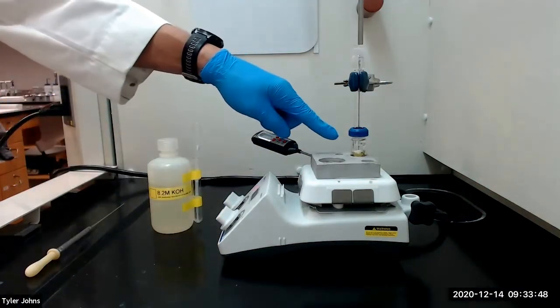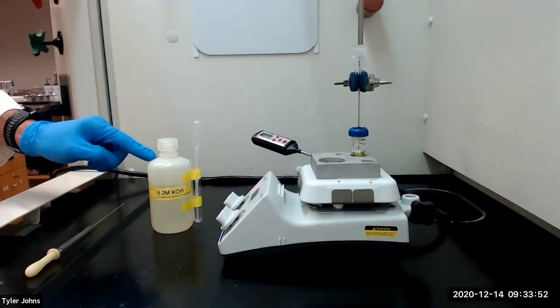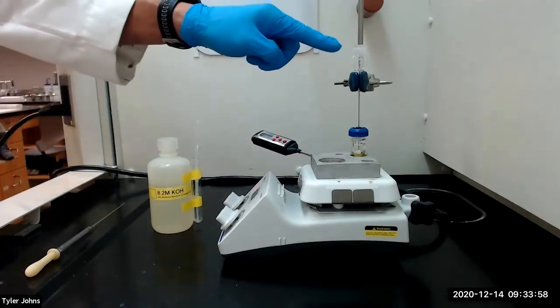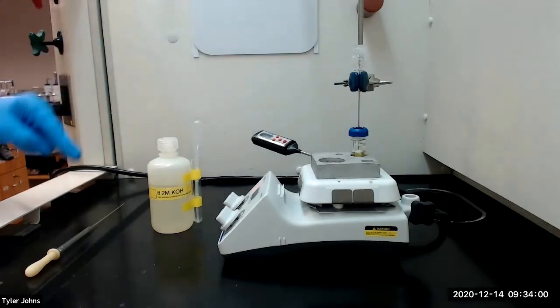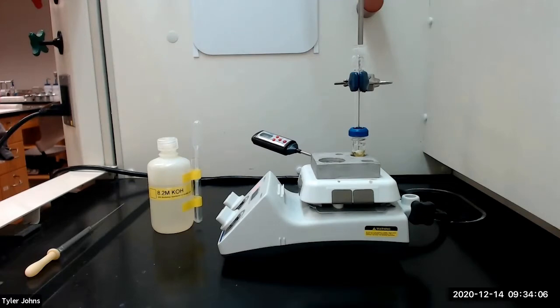After the benzil has completely dissolved, we will next add 0.25 milliliters of 8.2 molar aqueous potassium hydroxide solution dropwise down through the air condenser using a nine inch Pasteur pipette. We will then gently boil the mixture while stirring for 15 minutes.